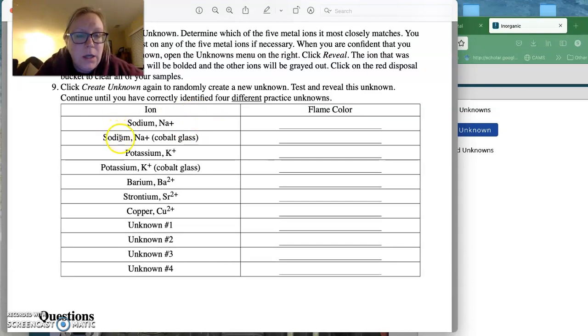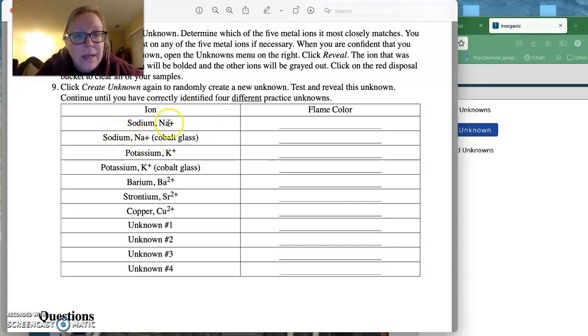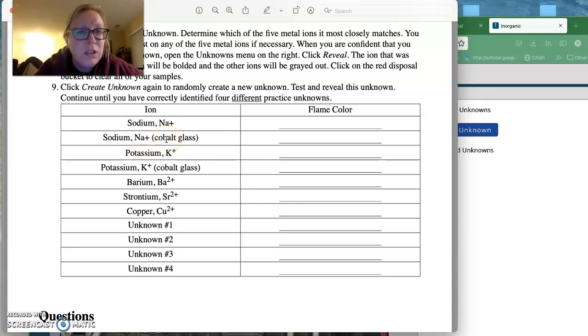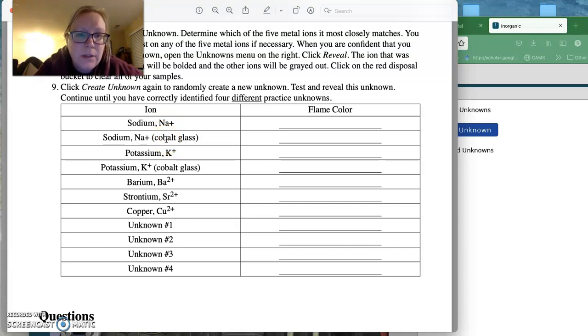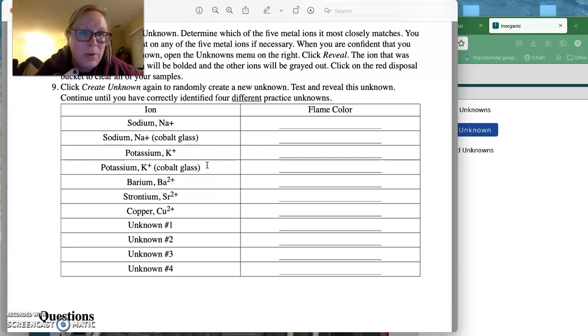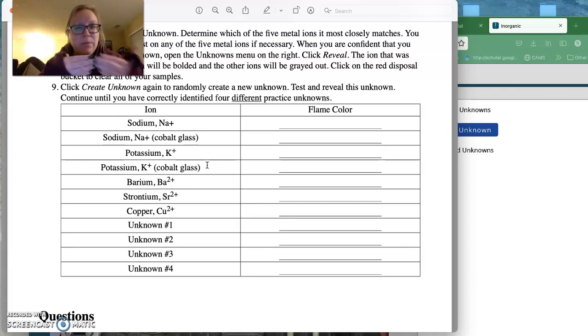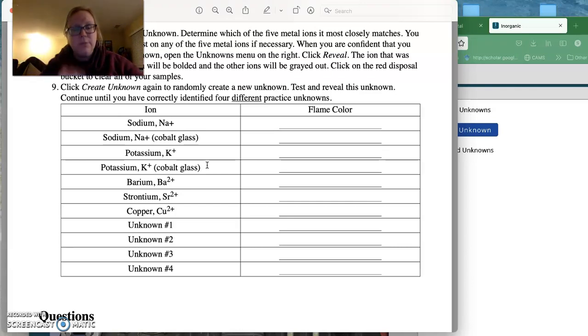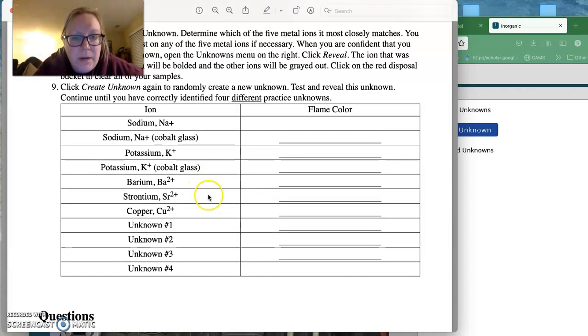And then the color of sodium in front of a cobalt glass. Now these are not different elements. It's the exact same thing. We're just going to use that cobalt glass to help us tell the difference between sodium and potassium because they look like the same color if we don't use this cobalt glass. So that's what the cobalt glass helps us do is it helps us differentiate those two colors. Then you're going to look at barium, strontium, and copper.